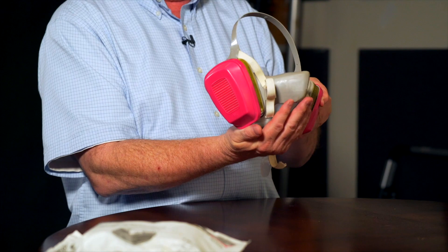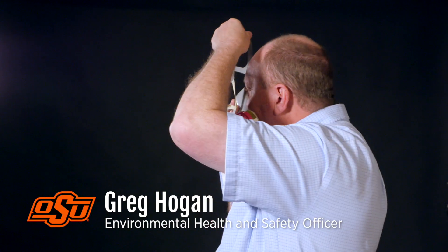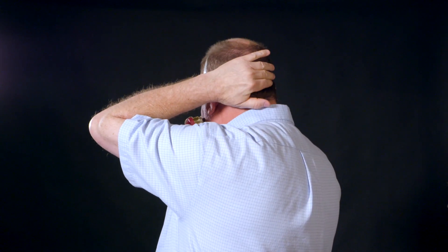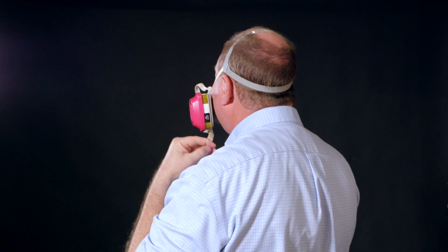Place the respirator directly in the palm of your hand, just like I have right here. You're going to take the top strap and put it directly up to the facial area. Pull the head strap completely back — it should go right above the edge of the ears.